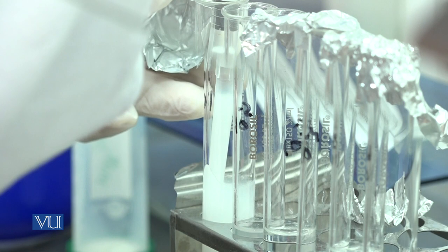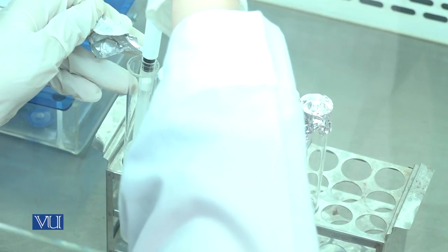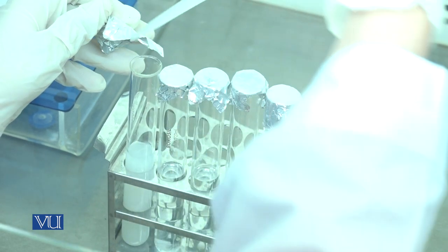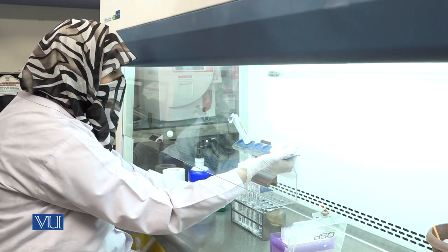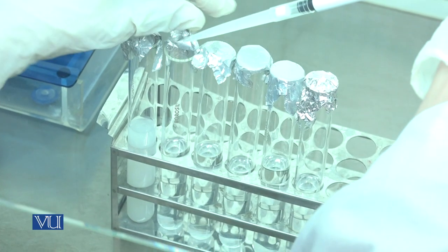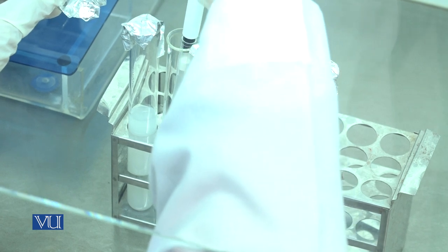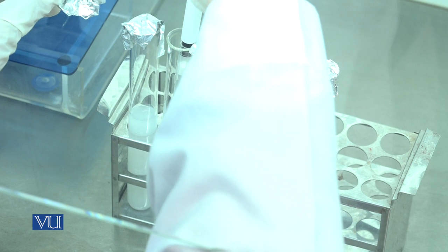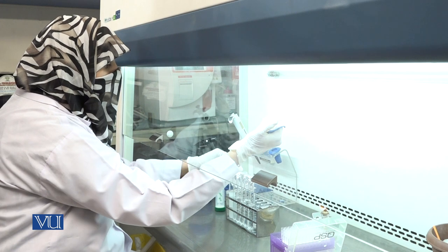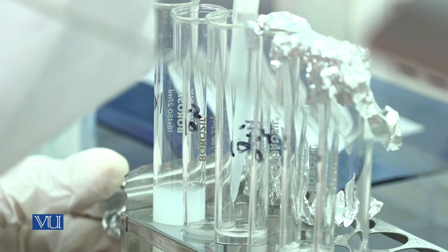Mix the sample properly in the first test tube. After mixing, pick 1 ml of sample again from the first test tube and add it into the second test tube containing 9 ml of sterile distilled water. Again, mix the sample properly. From the second test tube, pick 1 ml of sample and transfer it to the third test tube.